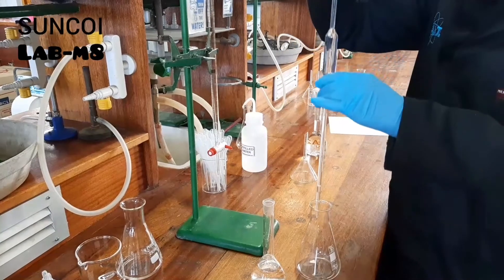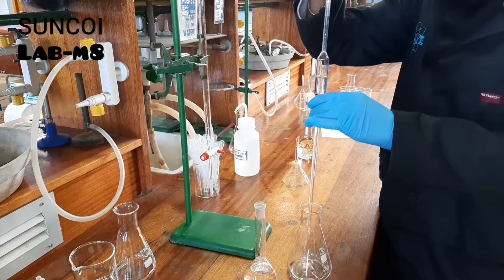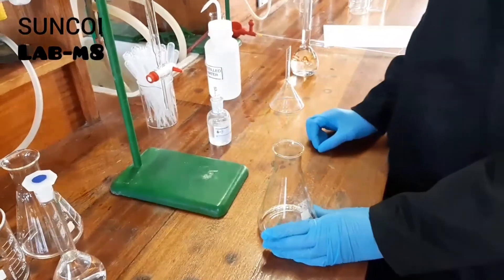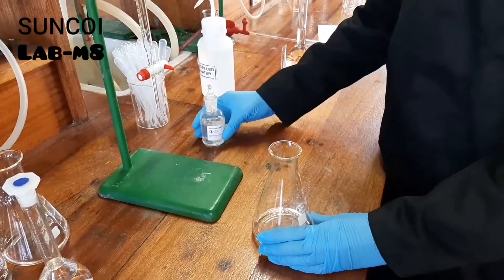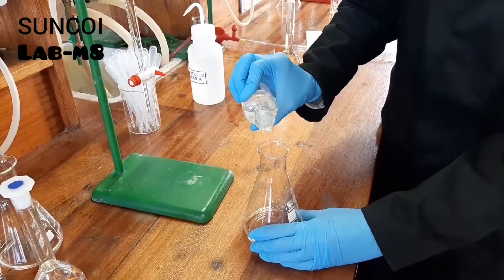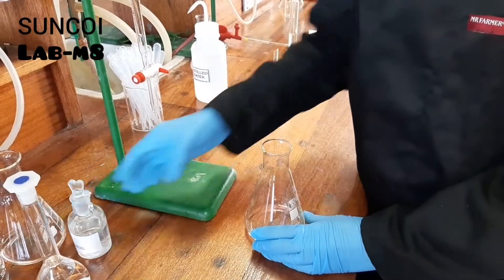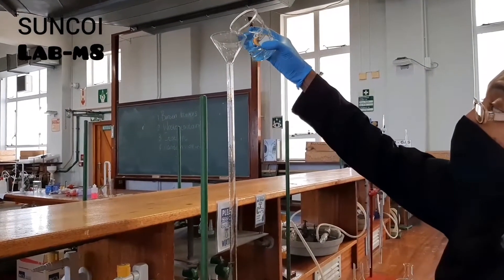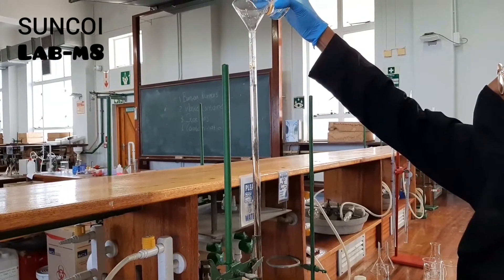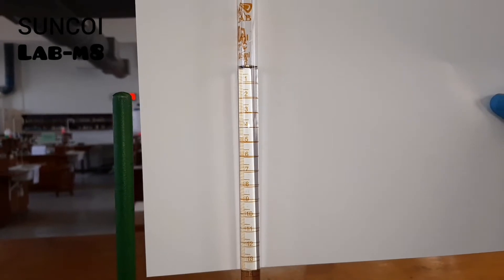Nusrat is just preparing for the titration. Megan took you through all the steps already — how to use the pipette and how to use the burette — so all she did was add 20 ml of oxalic acid to the conical flask and then add two drops of phenolphthalein. Now Nusrat is filling up the burette with the unknown sodium hydroxide solution and you can see it's at zero.